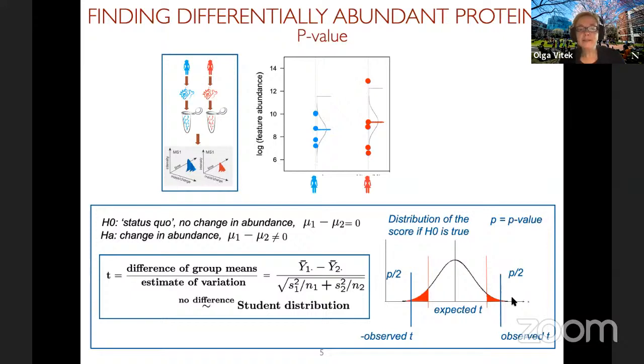So fundamentally, this part with the distribution is just based on the mathematics. A very common question is, what if our data are not normally distributed? Well, the signal to noise actually characterizes the means and not the actual distributions. So when the sample size increases, this signal to noise approximates a normal distribution. And this approximation is called the central limit theorem.